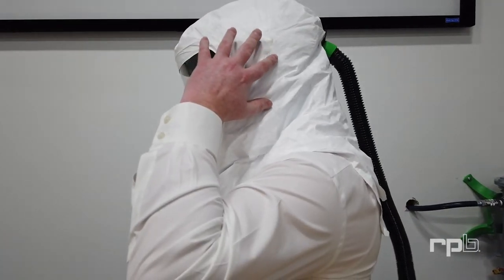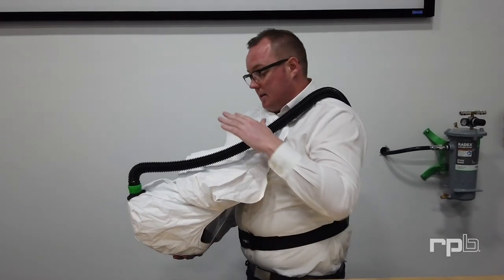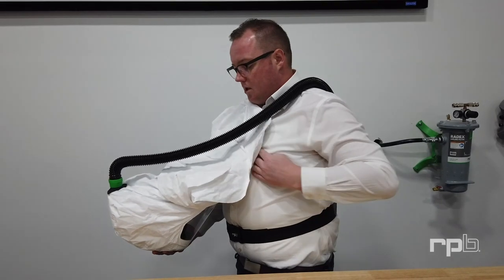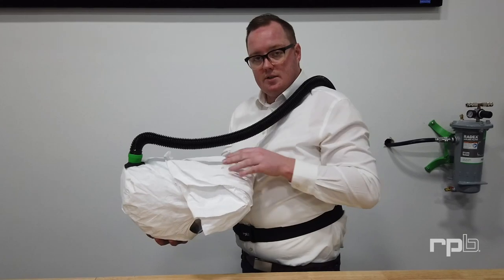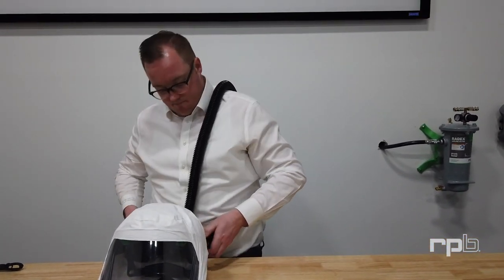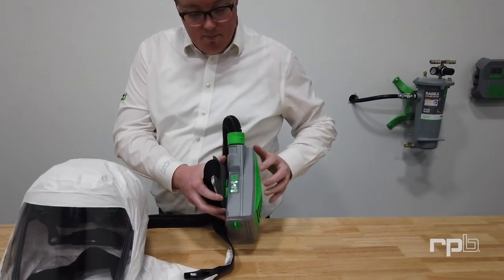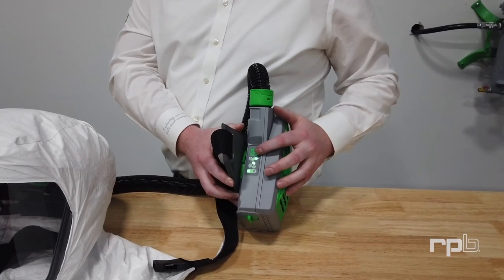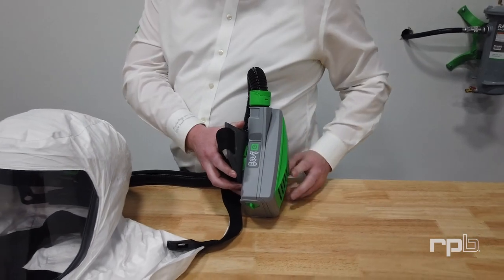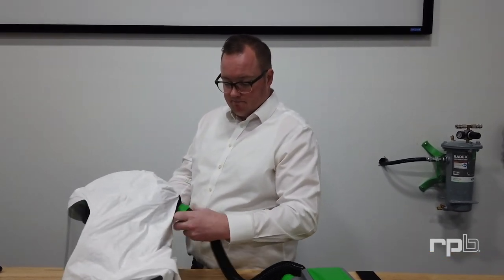When it comes time to doffing the respirator, grab it from either side and lift it straight up and away. That way you're not allowing any contaminants to get inside the breathing zone. Fold the shrouds to enclose the breathing zone and place it down on a table. You can then remove the PAPR and turn it off, ensuring you check the battery life and filter life to determine if you need to recharge or replace the filters. You can then remove the breathing tube from the T-Link — it's now ready for cleaning and decontamination.